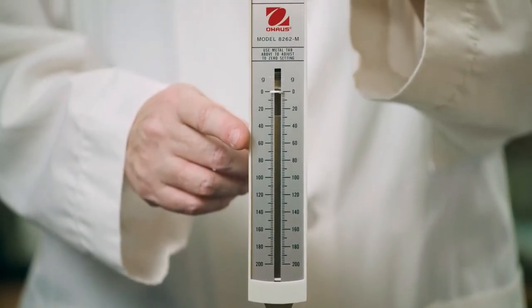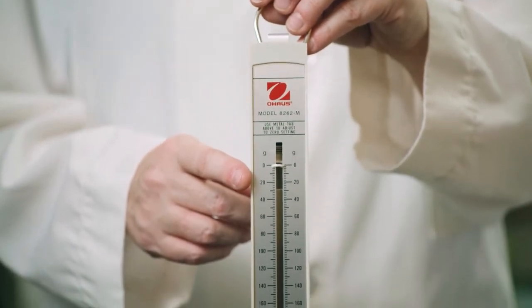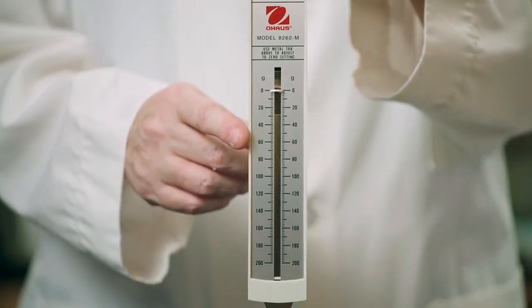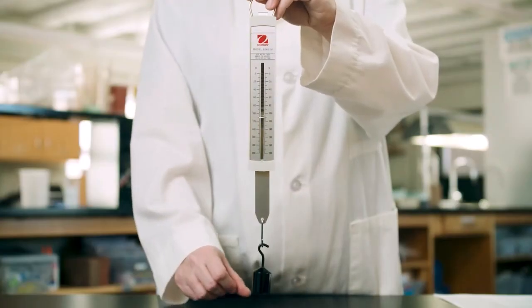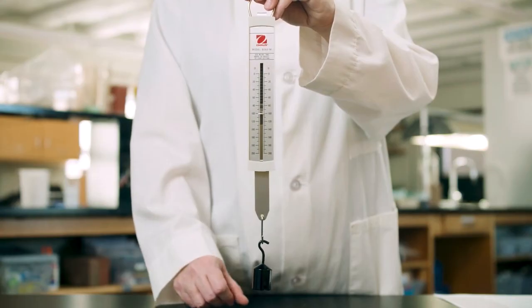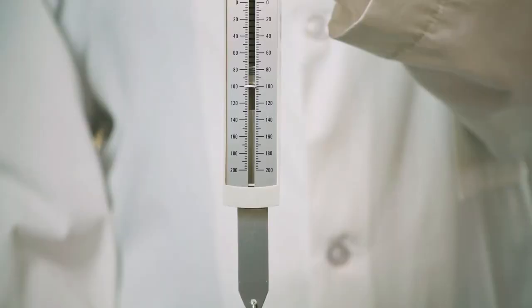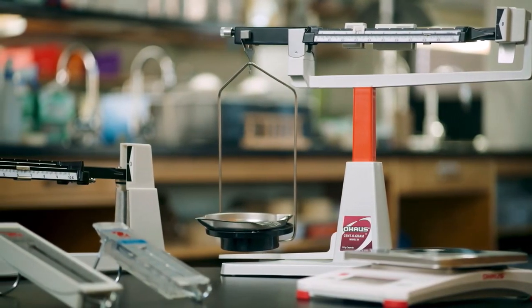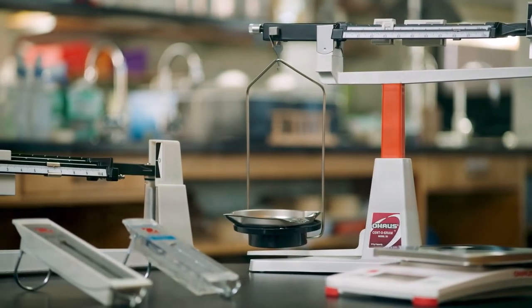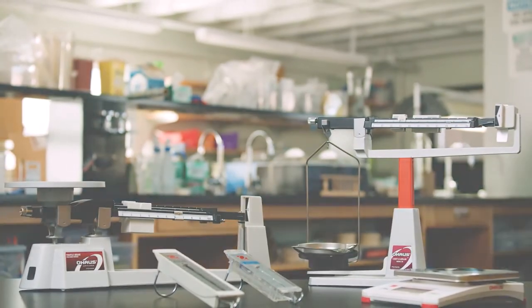Ensure that with no items on the scale it reads 0. If it does not read 0, then the scale will need calibration. If the scale is calibrated, hang the item to be weighed on the hook of the spring scale. Read the value shown on the spring scale. In this case, the object is 100 grams. Mastering the use of diverse measuring tools like balances, electronic scales, and spring scales empowers accurate and reliable measurements, crucial for scientific endeavors and everyday applications.